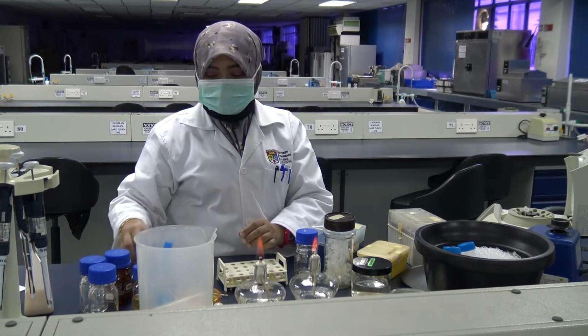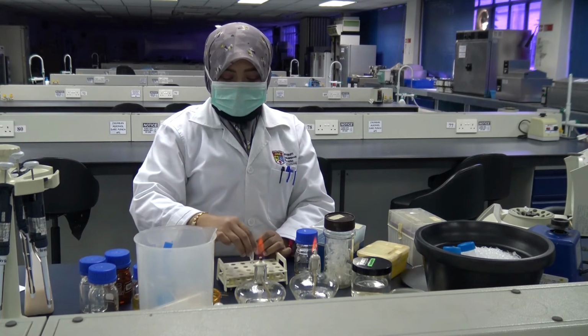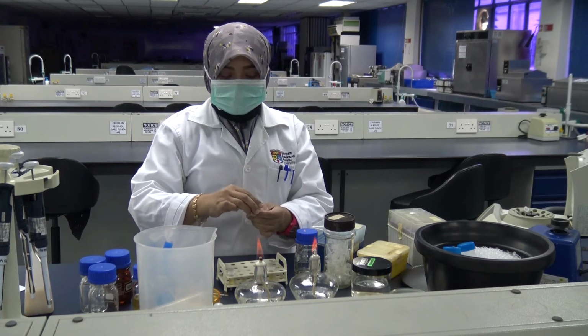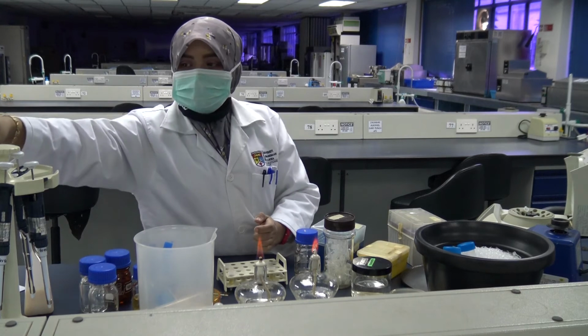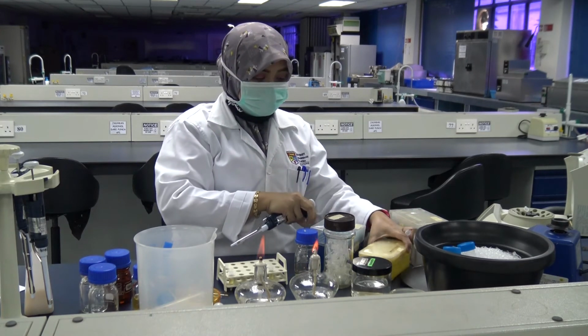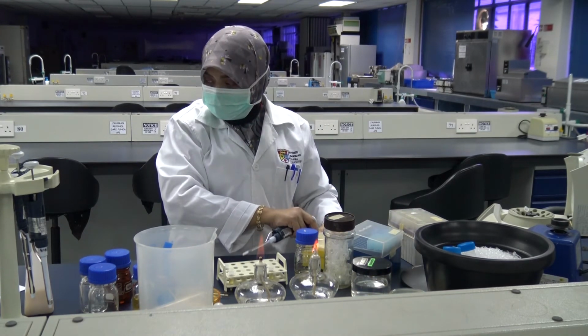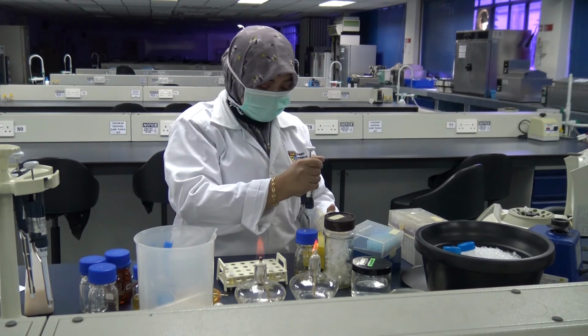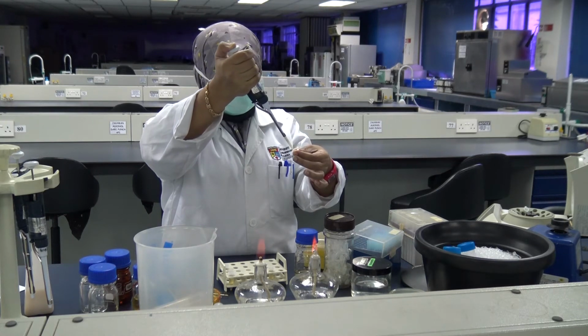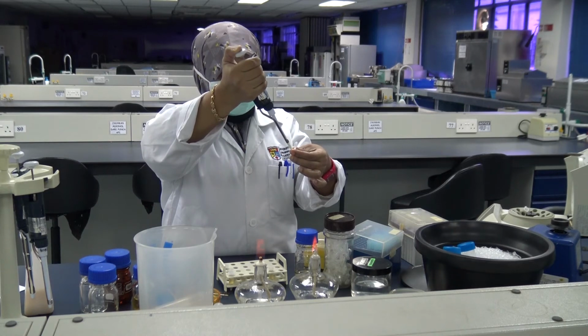What you do next is you mix the pellet into the remaining supernatant and transfer the whole volume onto nutrient agar plates. You ensure that the cell pellet is properly homogenized, that they're truly mixed, and then remove everything from the tube and transfer it onto NA plates.